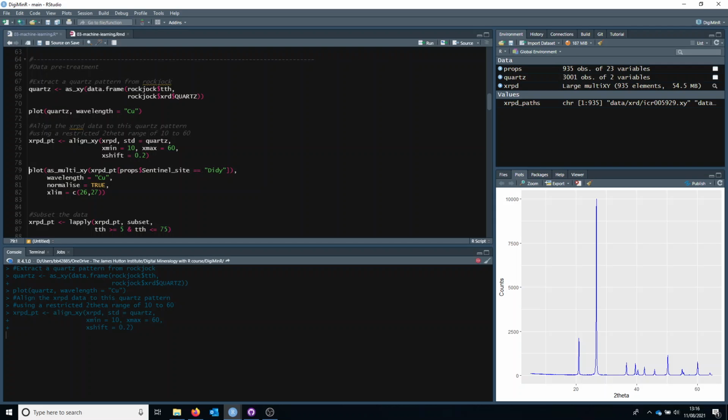this alignment routine, little pieces of data are chopped off either end due to the way the shifting works, and that will be by differing amounts depending on the alignment applied to the data. So then it needs to actually harmonize it all to the same 2 theta scale once they're all computed.